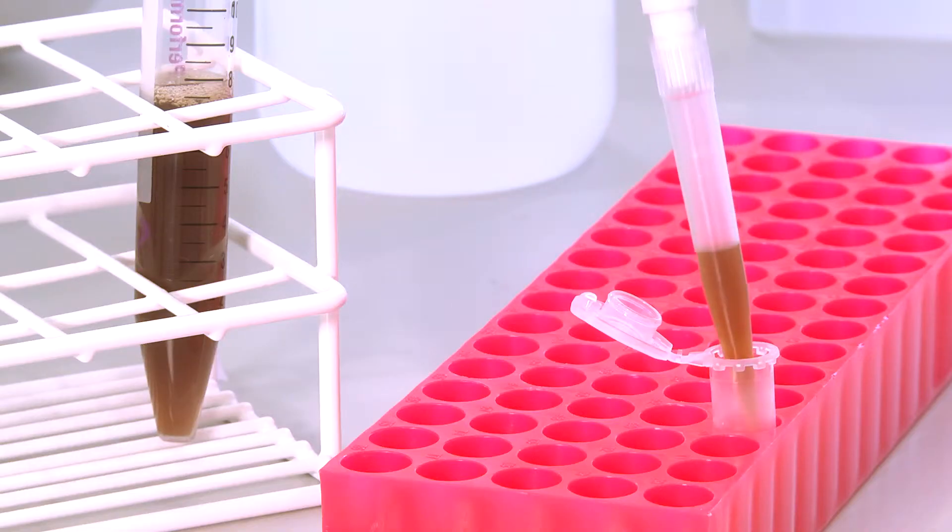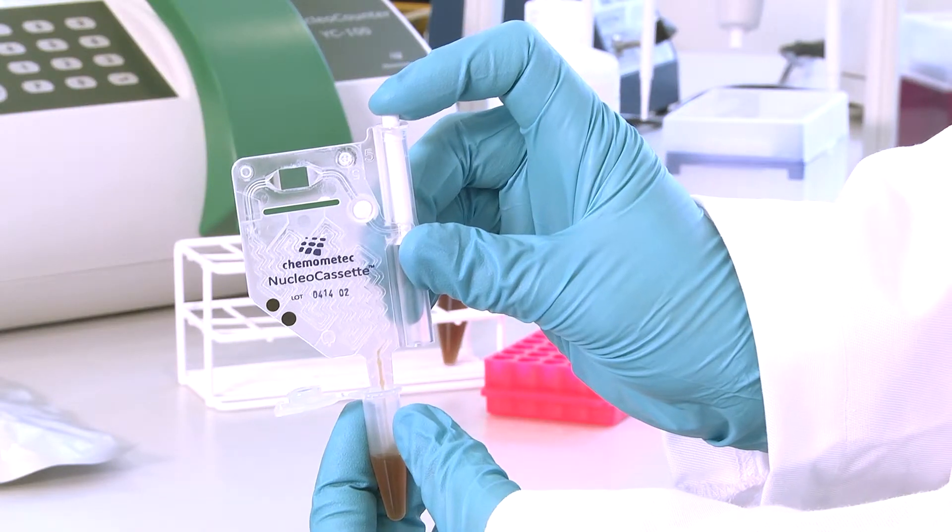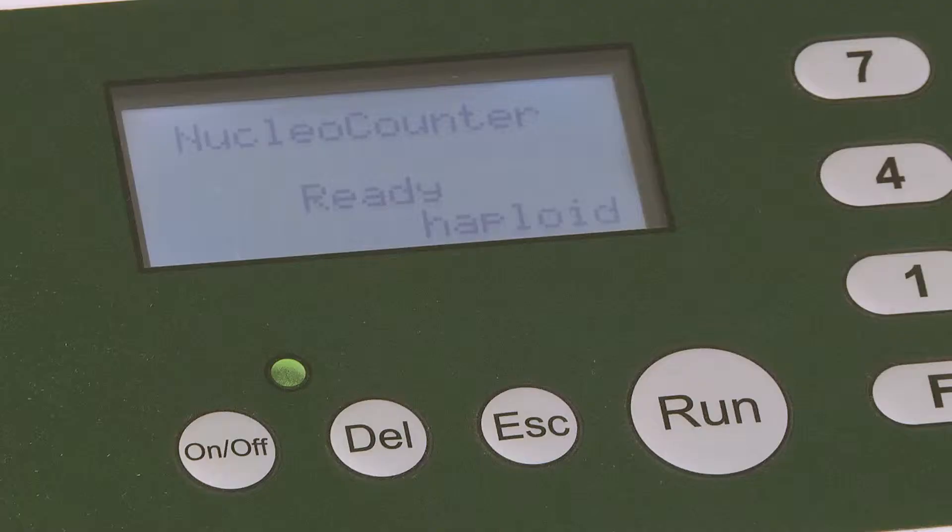Simply take a small sample of yeast, dilute with the supplied reagent, load the cassette, insert the cassette and press run. In 30 seconds the instrument shows the total cell count in the display.